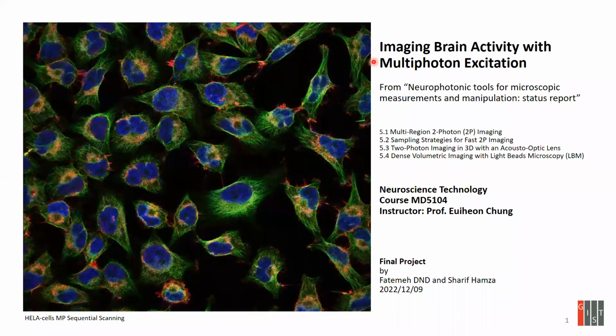Hello everyone. Today we are going to talk about imaging brain activity with multiphoton excitation. We will cover chapter 5, from 5.1 to 5.4 of the review paper. On the left side, we can see HeLa cells that are imaged using multiphoton sequential scanning.